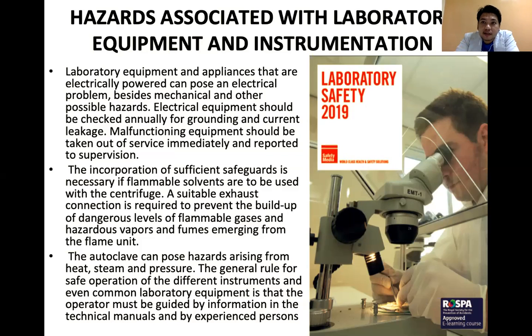So what happens? Buti na lang walang intern sa loob ng room. It burst open when the steam arises. So para siyang explosion. So kung nandun ka sa loob, probably napaso na yung tao. Buti na lang walang intern.